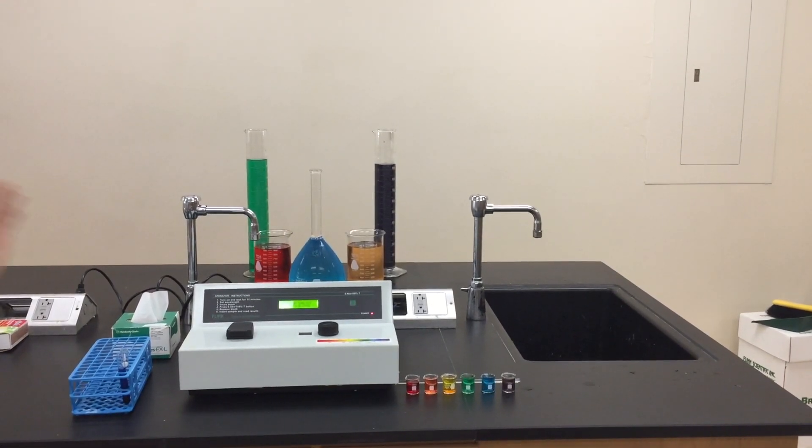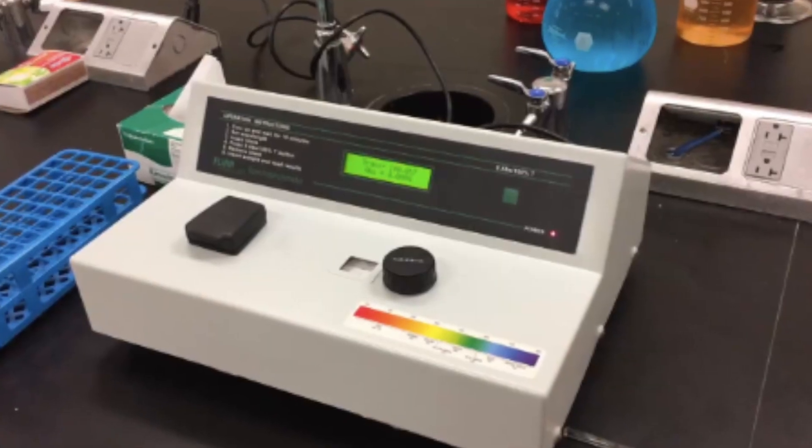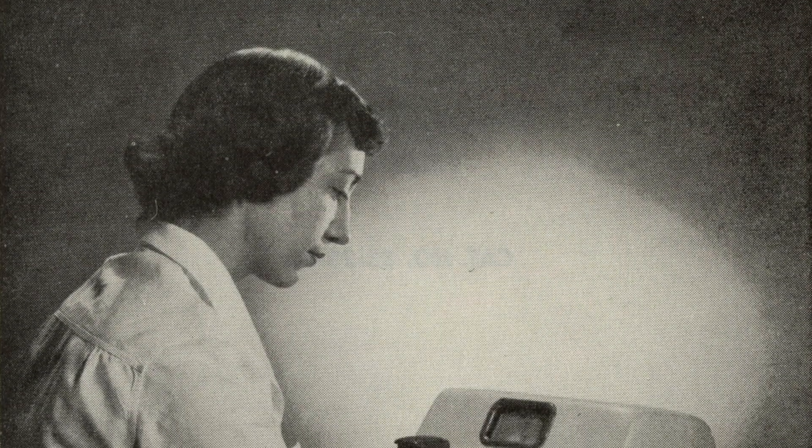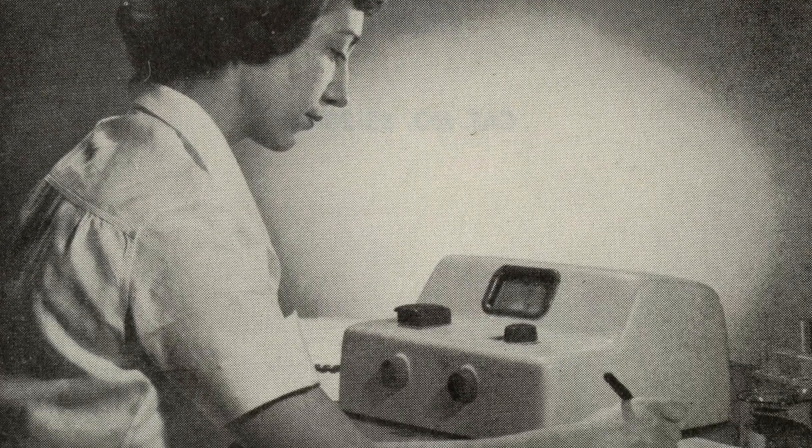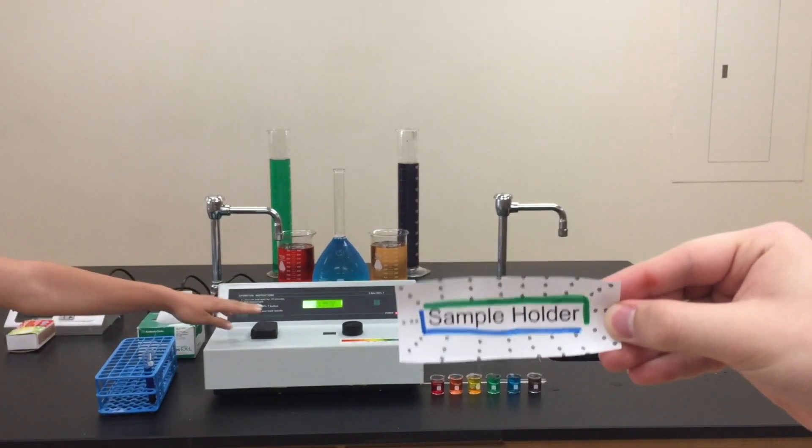Here we have a spectrometer, and today we are going to show you how to use it. The spectrometer is known more commonly as the Spec 20, and its production began in 1953. First, this is the sample holder. This is where you will insert the cuvette with the liquid you want to be measured.